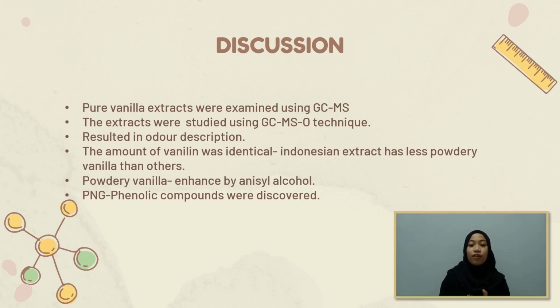The amount of vanillin in all three extracts was identical. However, the sensory evaluation revealed that the Indonesian extract has less powdery vanilla than the others. Powdery vanilla is enhanced by anisyl alcohol, which is found in Papua New Guinea extract. In Papua New Guinea, phenolic compounds were discovered.